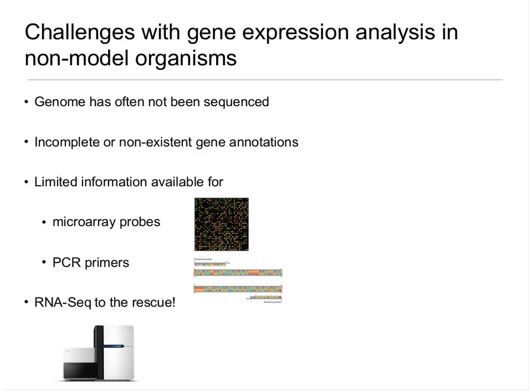The reason for that in the axolotl's case is that its genome is about 10 times larger than that of the human genome, which makes it difficult for assembly. In addition, often you have very incomplete or even no gene annotations whatsoever for such species, and the RNA information you do have is usually so limited that you don't have enough to make a comprehensive microarray or a comprehensive set of PCR primers that can be used to do quantitative PCR, say, of genes of interest. So that's where RNA-Seq technology really comes to the rescue, and that is really revolutionizing this particular type of application.